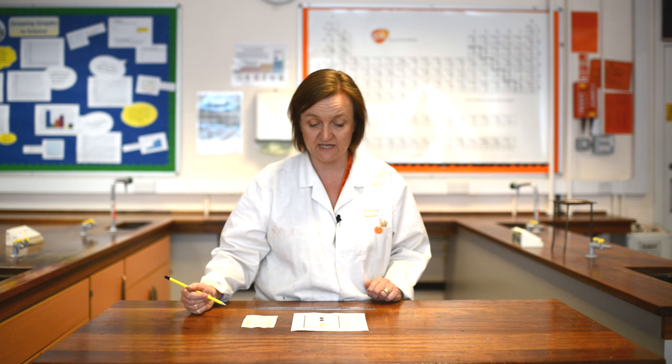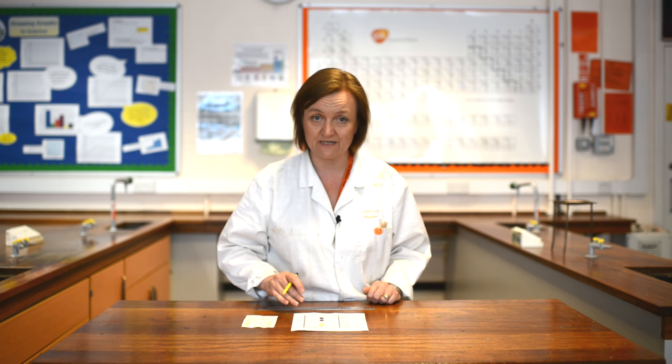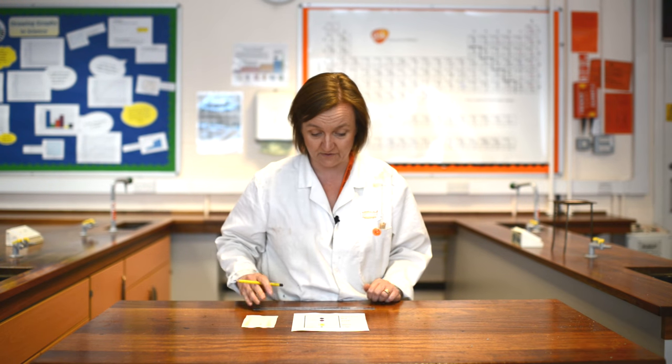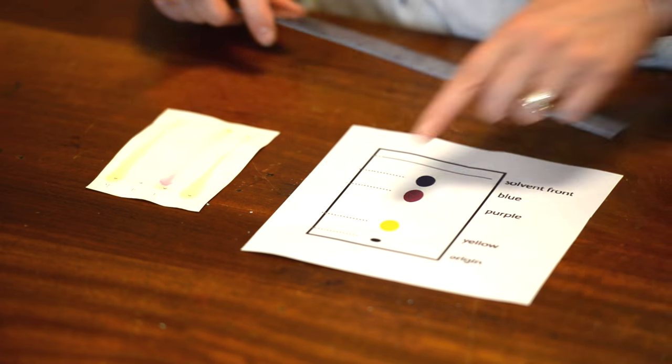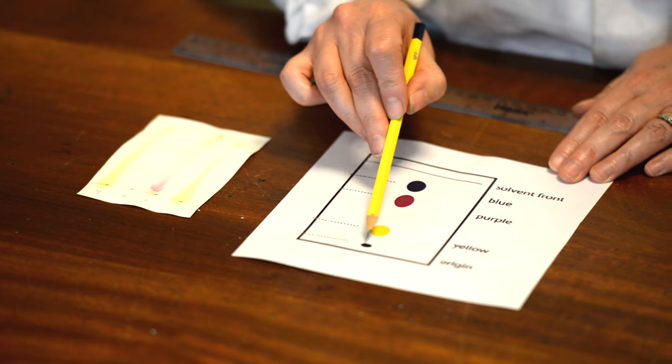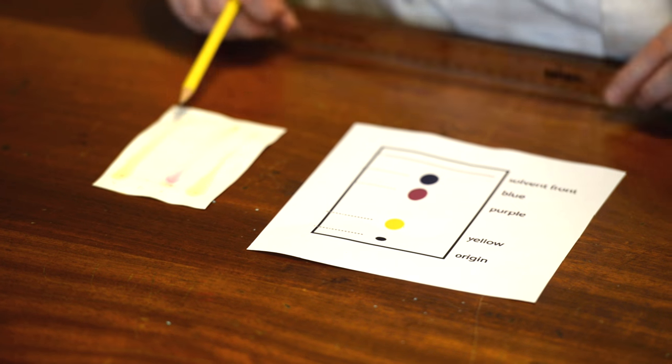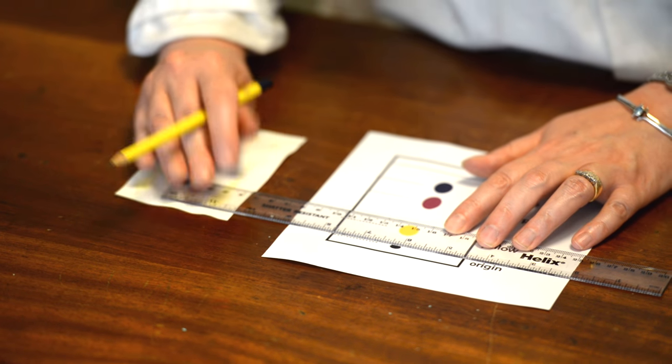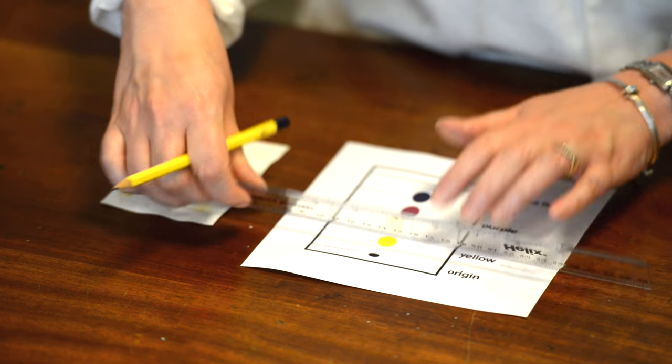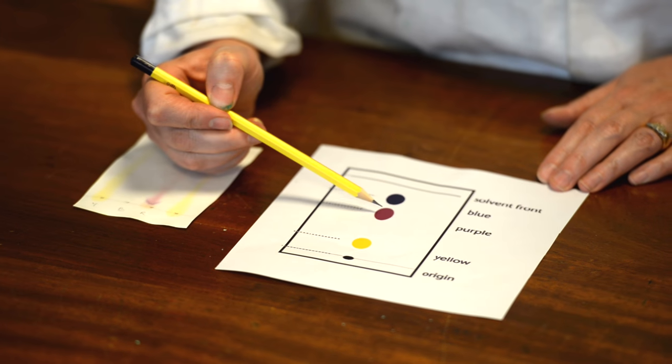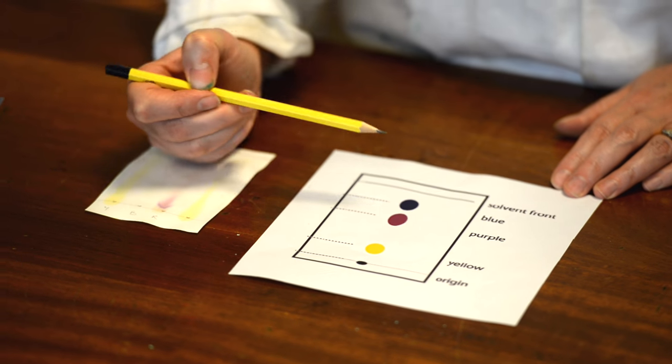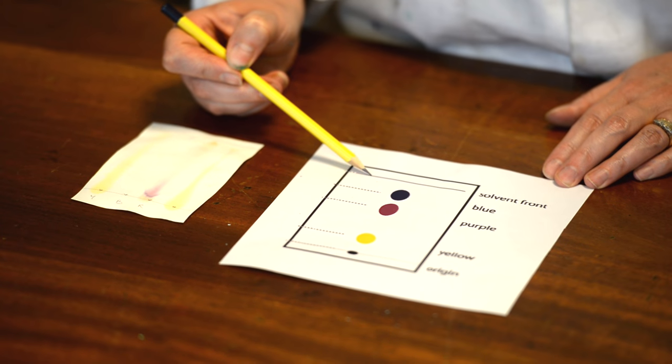You need to be able to calculate an RF value, which is a measurement of how far the individual colors have traveled. That's difficult to do on the chromatogram that I've made, so I'm just going to demonstrate that using this picture that I've got here. On this one we can see we've got our origin, the baseline which I drew on with a pencil. You can see we've got a series of color dots which have separated, and this is as far as the solvent has traveled.